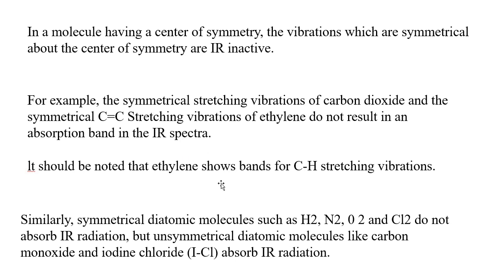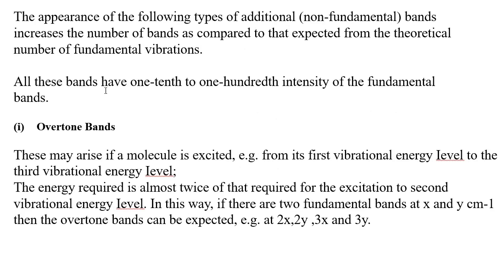That is important. The appearance of certain additional bands in addition to fundamental bands, all of which have a very low intensity compared to the fundamental bands, increases the expected theoretical number of bands.